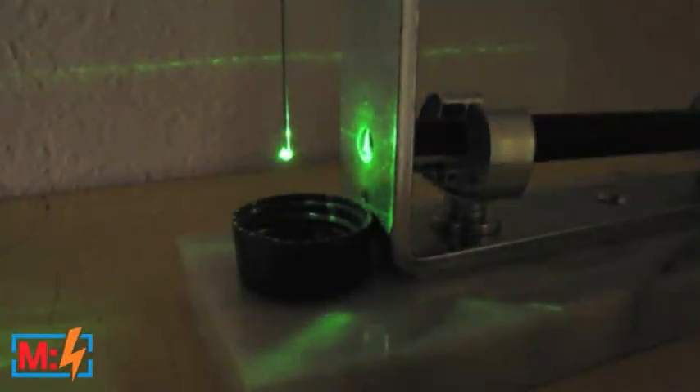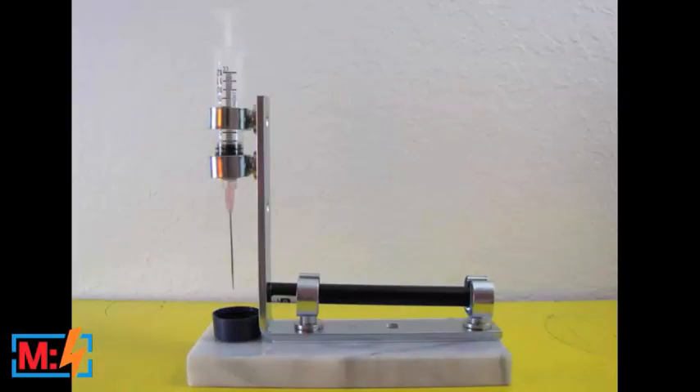What you've got basically is a relatively high-powered green laser pointer, arranged so that the laser shines through the side of a hanging drop of water, which is approximately spherical. The drop serves as a lens that projects the laser light onto the wall, and the really cool effect is that you can actually see microscopic flora and fauna in the drop of water.